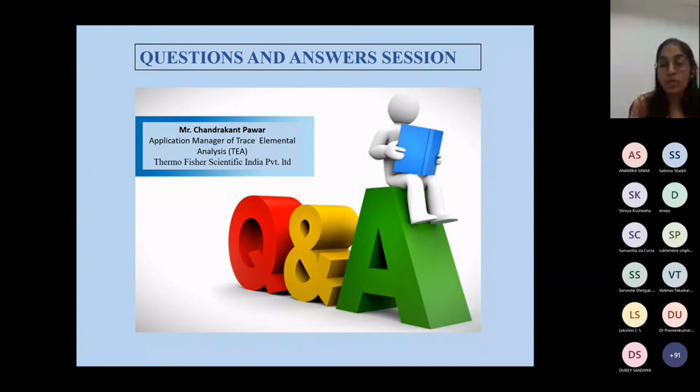Okay. Thank you, sir. So the next question is from Kokan. He's saying that in case of pitch, that is the bottom-end product from crude oil, it will stick to the crucible. So how can we clean it after use? Can you repeat that question? I could not understand. He's saying that in case of pitch, that is the bottom-end product from the crude oil, it will stick to the crucible. So how can we clean it after the use?